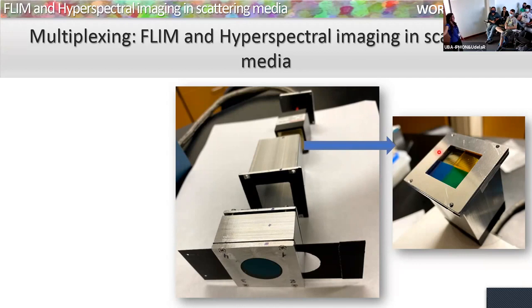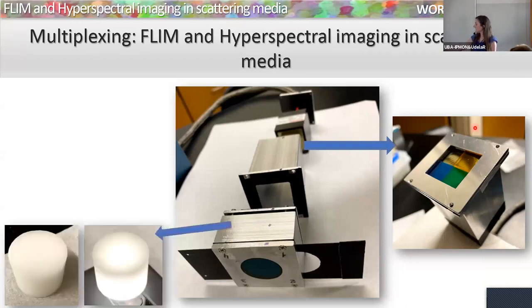This is the total intensity with no filter. Here we have our linear one, but we can combine and put all different filters of whatever we want, and also measure FLIM at the same time, and we can put an NADH filter, etc. The other thing is that from the excitation point, all the photons arrive at this wide area detector, and then we need the photons to travel to the different channels. So we needed to add a scatter plate inside, so the photons could reach the different channels in the detector. And we're working on that.